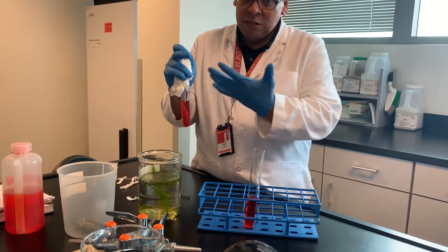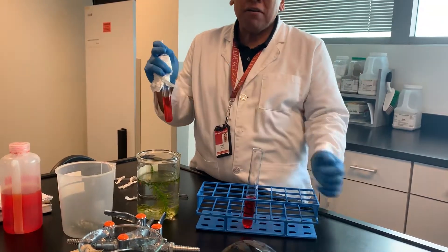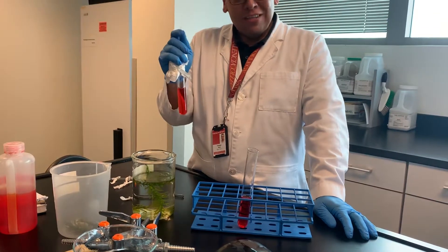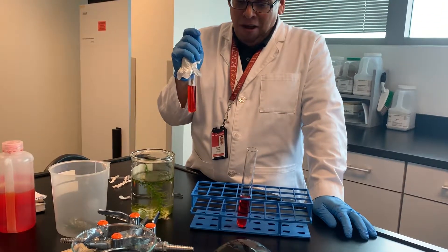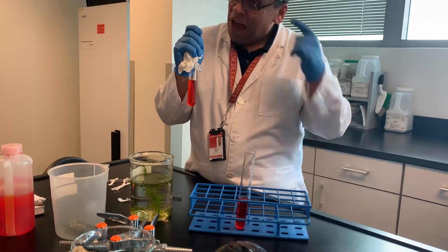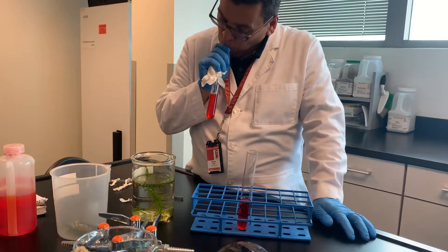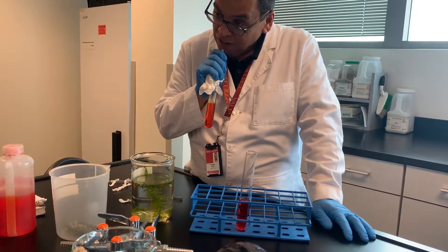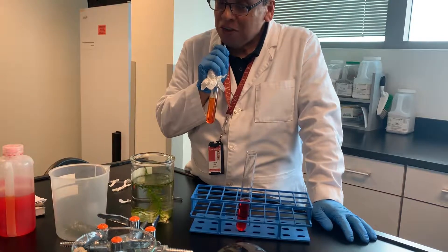I put this paper towel here in case I splash it — it goes on the paper, not me. So I do this: I have a straw, and this time I'm blowing in, not drinking. What color would it turn? A little bit yellow.